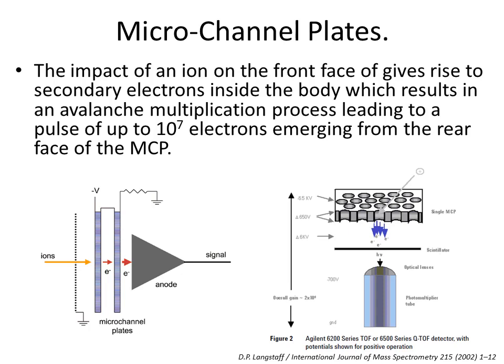Time-of-flight analyzers are coupled with microchannel plates. A charged ion hits the front of the plate and causes a cascade of electrons to hit an electrode, resulting in signal amplification. The mass is determined by measuring the time from the start signal, coinciding with the ions being pulsed by the pusher, and the ions of a single mass hitting the detector.